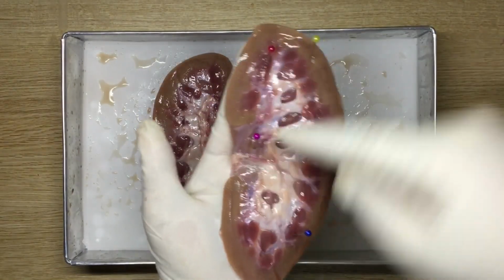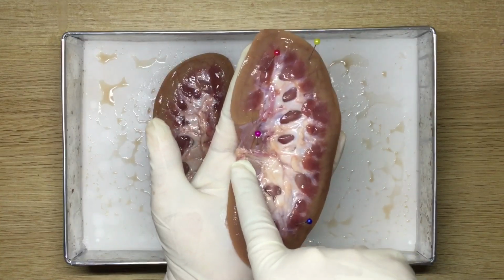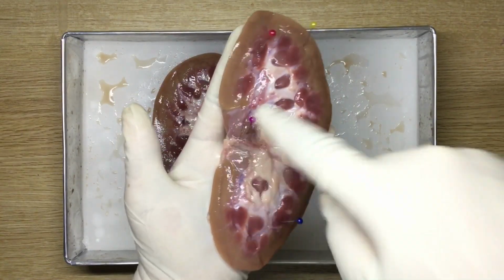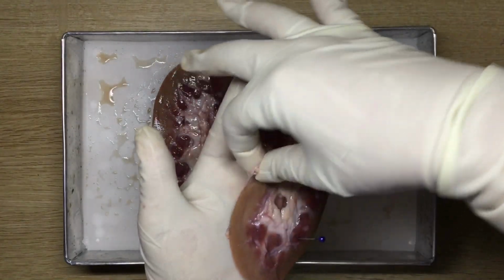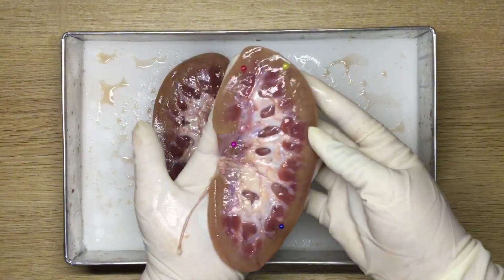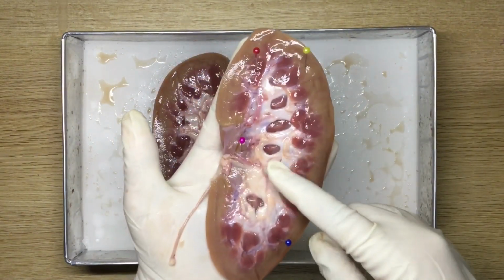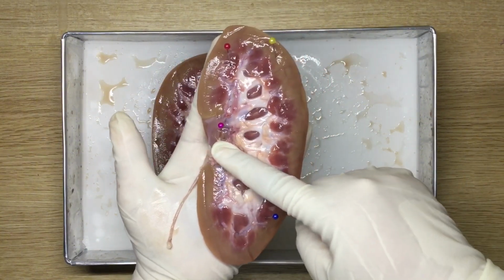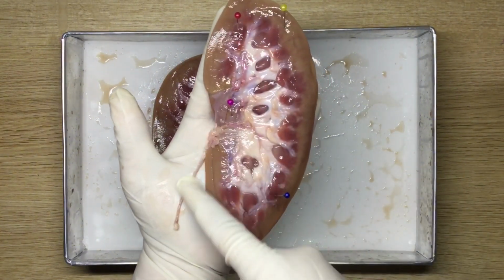The renal pelvis is a hollow structure that feeds into the ureter, and extending from the pelvis are collecting ducts, which go to the medulla. You can see the tubules that connect to the collecting ducts reach into the medulla, which are connected to the nephrons, and there are approximately 1 million nephrons per kidney.